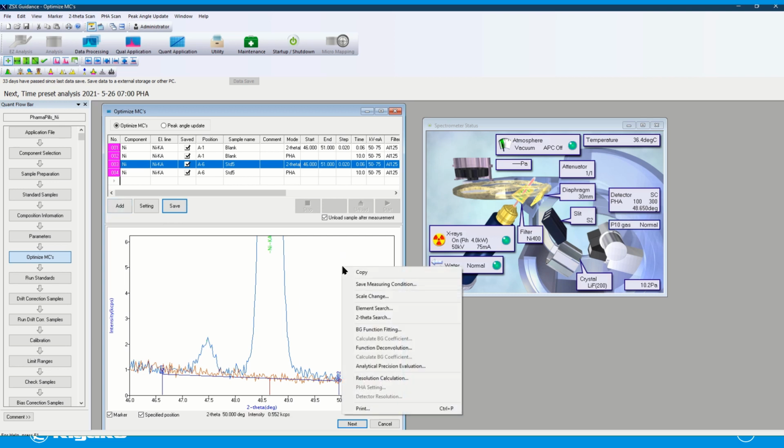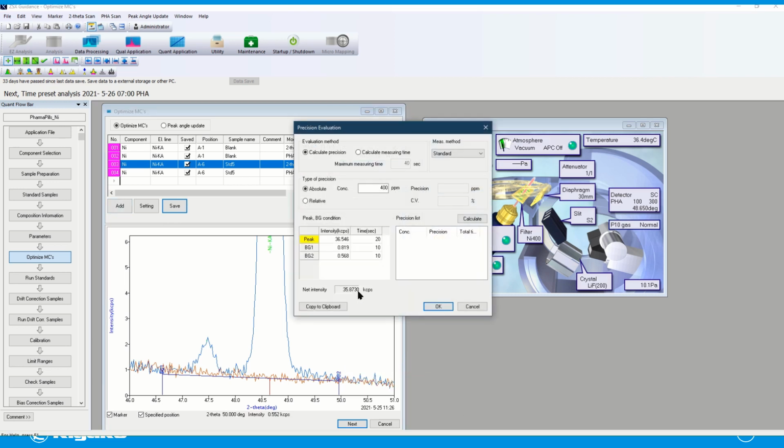And the last step, as we said in the first part, is just set where our analysis time is. So the 2J level, the 1J was 200 ppm, the 2J level is 400. It's going to say, based on this kind of counting time, I have a detection limit of 0.3 ppm, which means I could quantify below a ppm. Of course, our lowest standard here is 20 ppm, because that's a 0.1J level at the 1 gram daily dose.